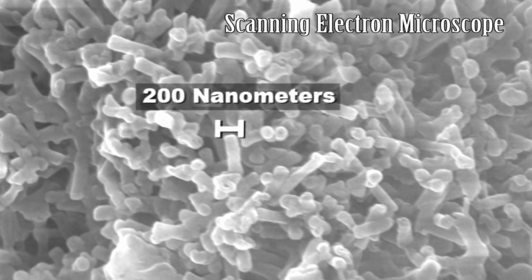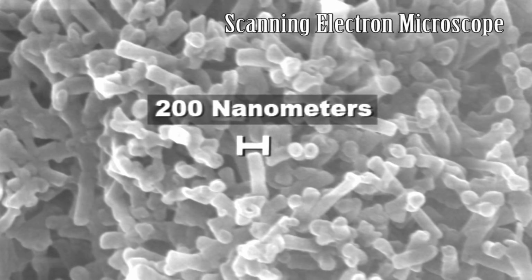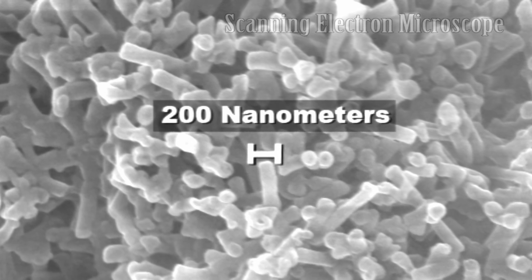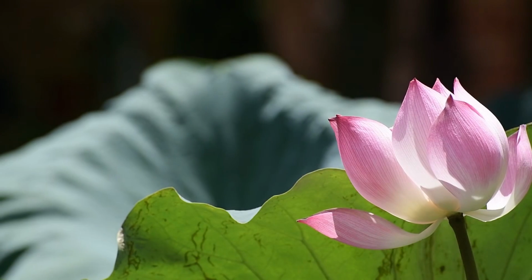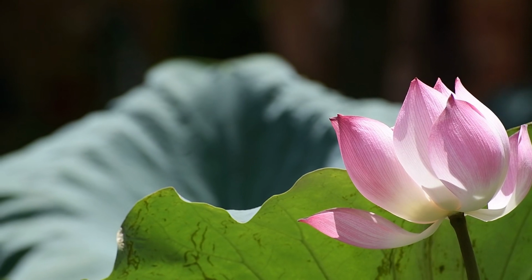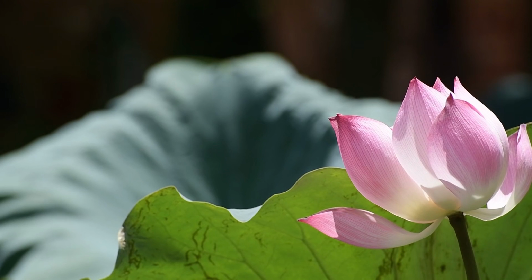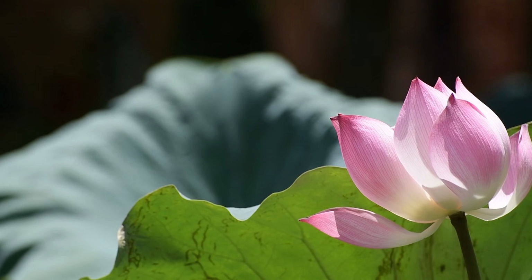Since we discovered that, people started using this technology to create some special materials for our use. Researchers started creating hydrophobic fabrics, which repel the water, or self-cleaning coatings, and surfaces which can repel the water to filter some elements out. So we can see how many other things we can observe using SEM. These are just examples of a few.